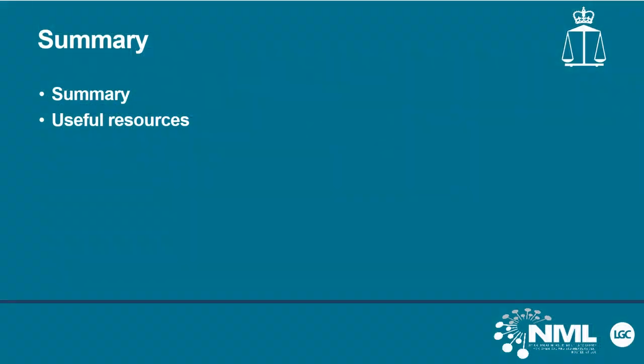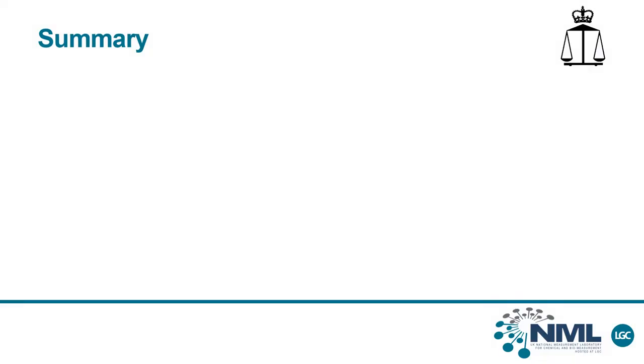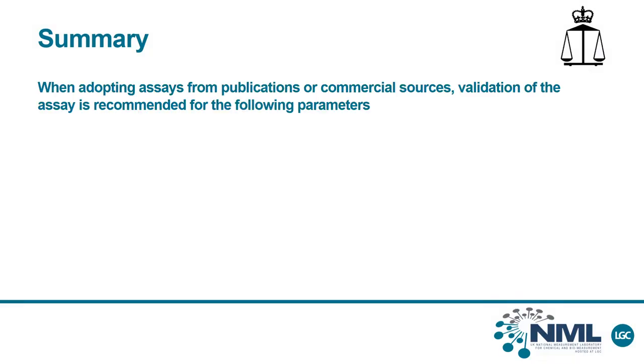In the following slides, the key points of the presentation will be briefly summarized, as well as the recommended acceptance criteria for the assay performance parameters described in the preceding slides. A list of useful tools, resources and references is also provided. To summarize this e-seminar, when establishing newly designed in-house quantitative assays or adopting those from the scientific literature or commercial sources, it is strongly recommended that their performance be validated.